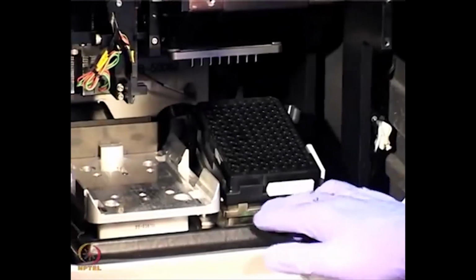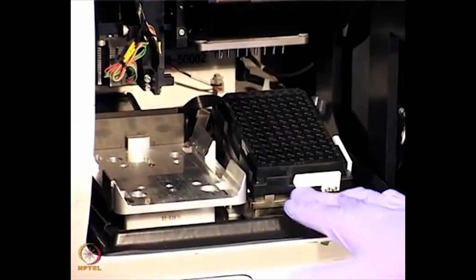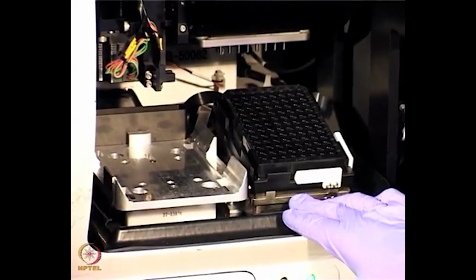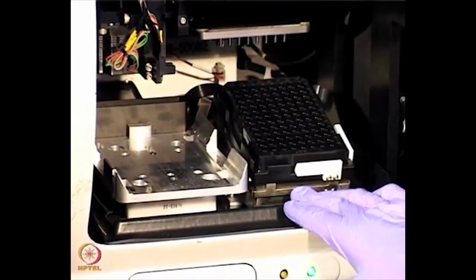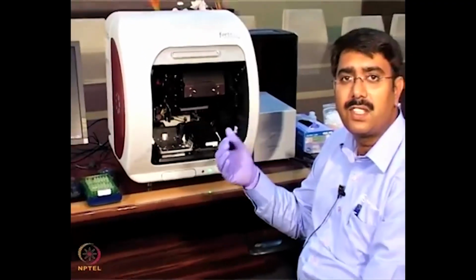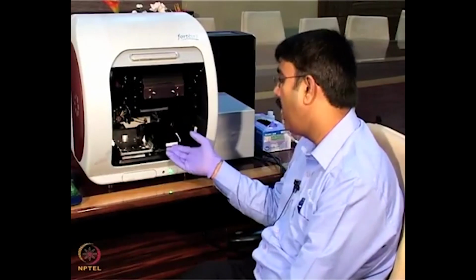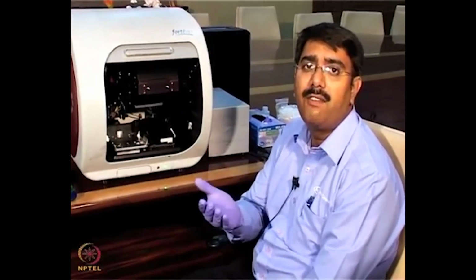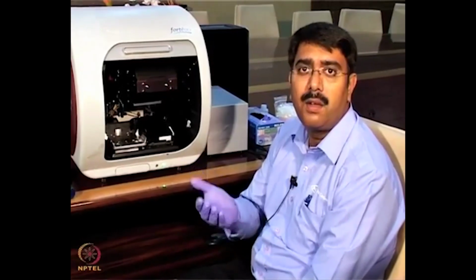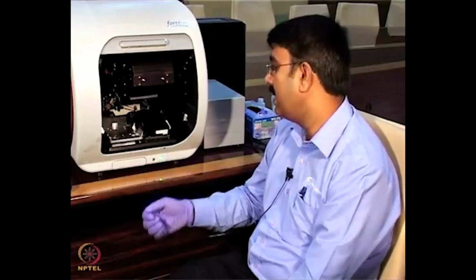If you look at this sample compartment, the BLI technology works on the dip and read method. Here we do not have any microfluidics devices, so to assist the binding, we have a shaker. The shaker works from 150 rpm to 1500 rpm, and the sample plate also has temperature control. We can work from the ambient room temperature, like 23 plus or minus 4 degrees, up to 40 degrees centigrade.